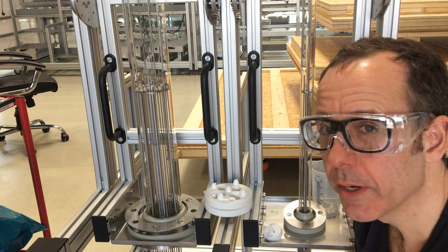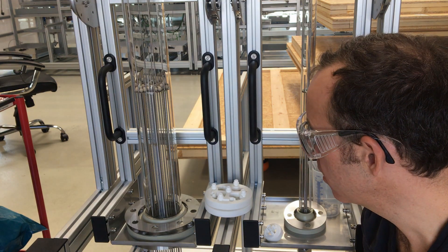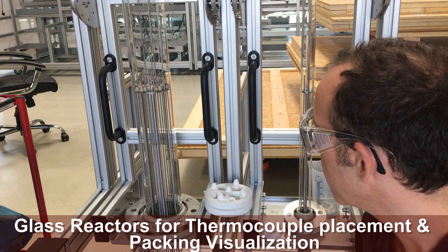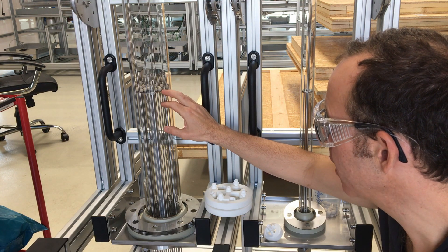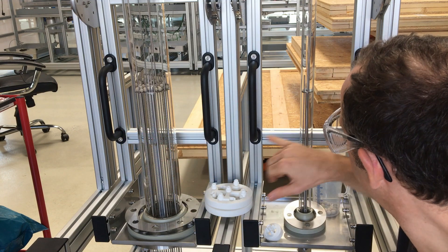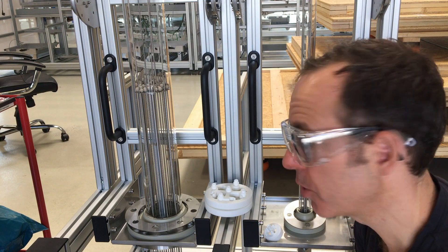For this unit we had to make some interesting tools so that the client can actually better see where the thermocouples are placed, how the particles fill, etc. For that we made some glass mimics of the reactors — here you see a 1 inch reactor, and here you see a 4 inch glass mimic. Here you see a sieve which is used for holding the catalyst bed in place; this can be mounted at any axial position. Here you see all of the different radially located thermocouples in the bottom, then a number of others extending higher up — these are the multi-point thermocouples used for axial temperature measurements.